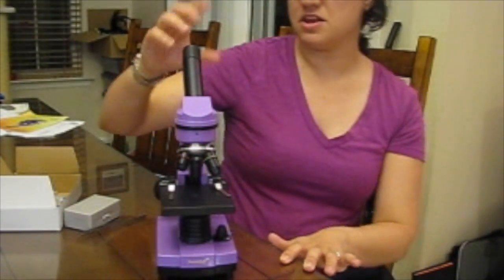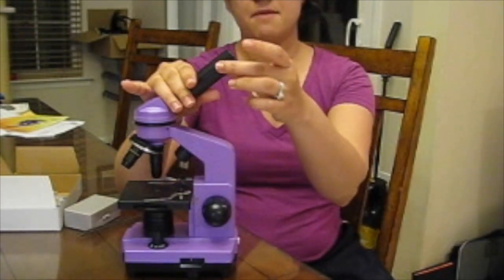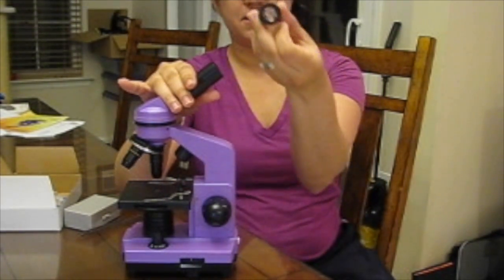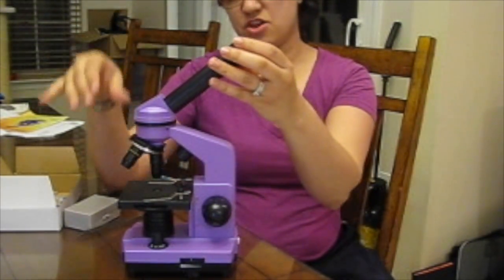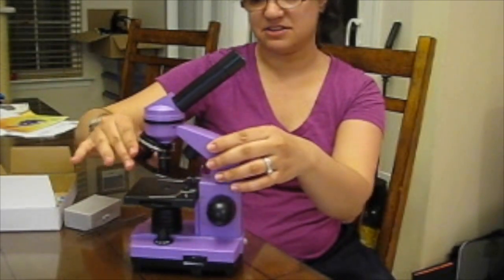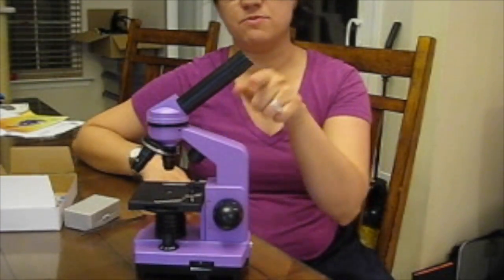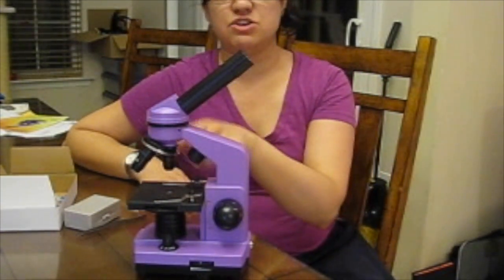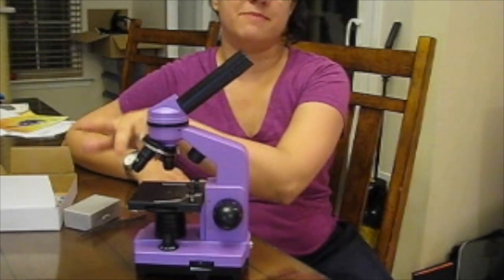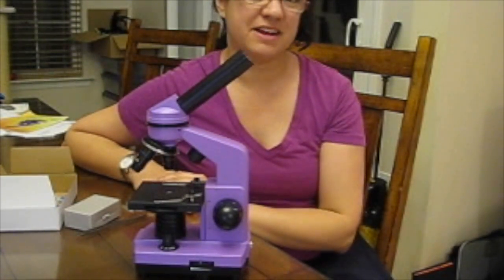So it has the lens piece includes a 10 times magnifying lens. And then there are three rotating lenses, which are 10x, 4x, and 40x. So you multiply the two together and you get 40 times, 100 times, and 400 times the magnification.